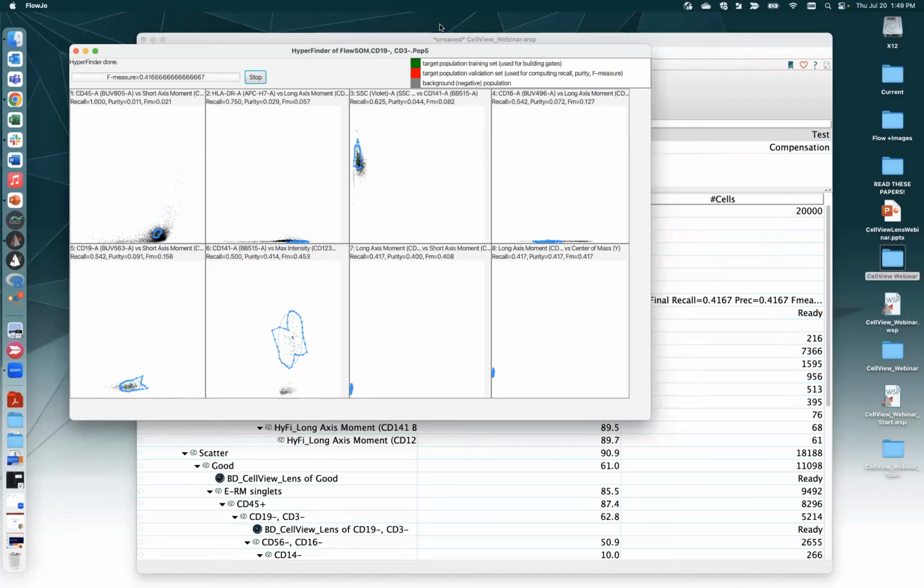If you've seen a talk where somebody presents imaging at any conference or user group meeting, it feels like it's been really easy for the presenter to walk up and go, here's your typical singlets gate. And look at that. From in that singlets gate, I can find a whole bunch of garbage, debris, et cetera, that we've all just used the law of large numbers to assume that, well, most of it's going to be fine. So you can definitely get cleaner data no matter what.